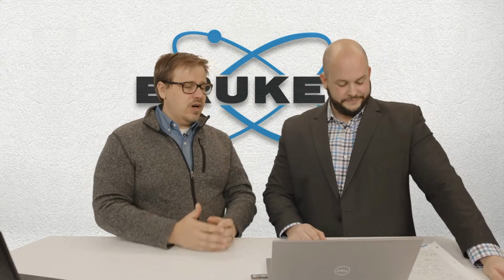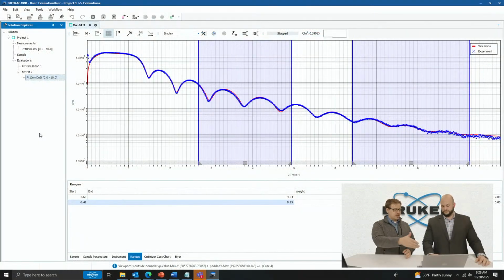Now, what if we wanted to get, say, a report out? What if I wanted to see the result? Do I have to just take screenshots, or how do I do that? If you wanted to export the data, you can very easily do that.